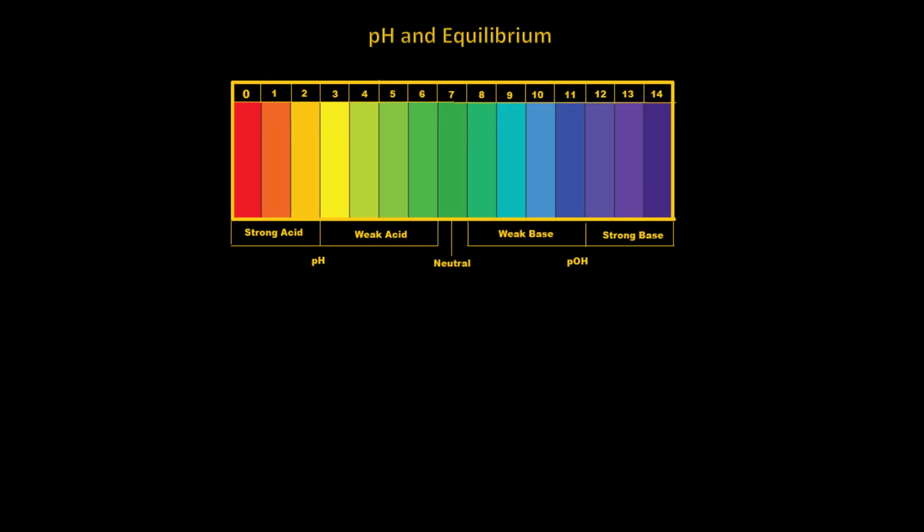At equilibrium, the acid is neutralized by the base. The neutralization is based on the solution's concentration of either the base or the acid. pH can be determined by using litmus paper or by using a pH meter. This can also be determined algebraically, but for now, it is important to know the equations that can be used to determine the strength of an acid and a base without a titration, although it is not as accurate as a titration. These equations are important when we look at selecting an endpoint indicator.